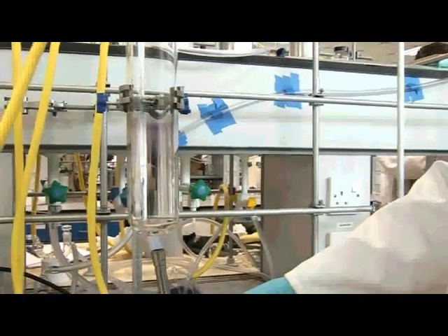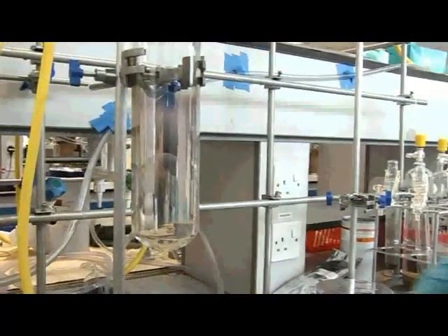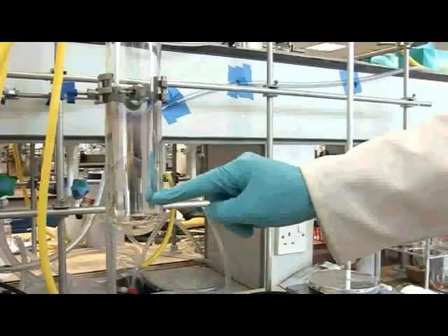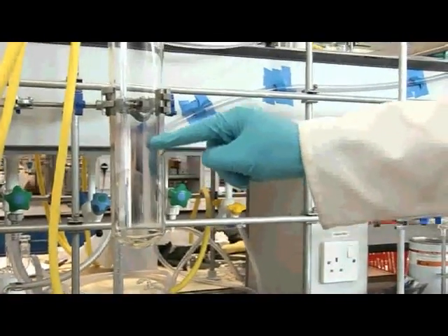The reason we do it like this is that we end up with a large surface area of potassium, so it's excellent for keeping our solvents dry. What we've got now is the ampule, and all the way up here this is literally a mirror of very thin potassium.